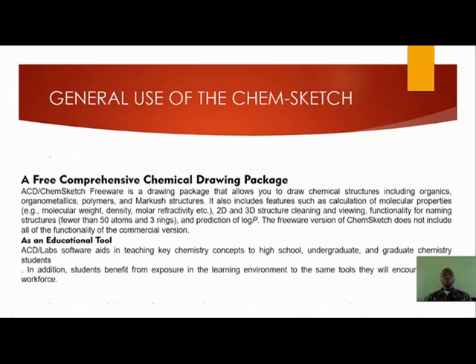Well, the general use of the Chem-sketch software is a free comprehensive chemical drawing package. ACD Chem-sketch is a drawing package that allows you to draw chemical structures including organics, organometallics, polymers, and Markush structures. It also includes features such as calculation of molecular properties, e.g., molecular weight, density, molar refractivity, etc. You can also draw 2D and 3D structures, cleaning and viewing, functionality and naming of structures fewer than 50 atoms and 3 rings, and the prediction of logP.